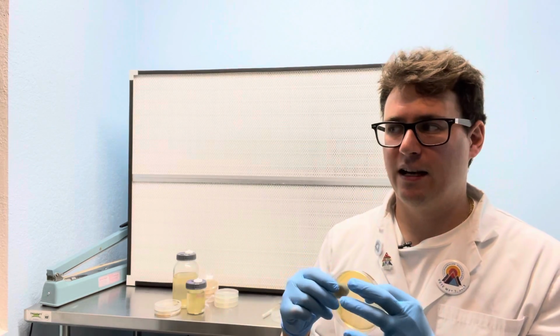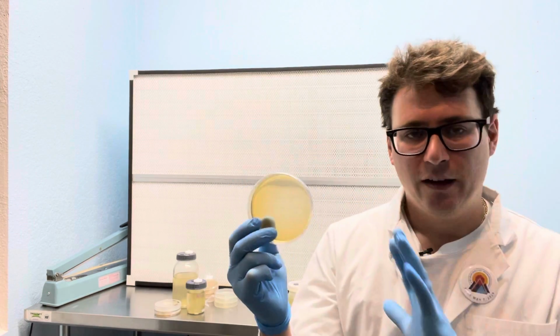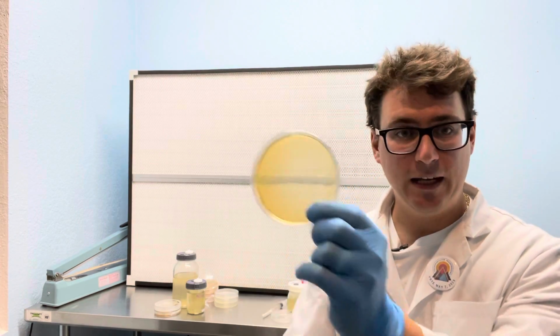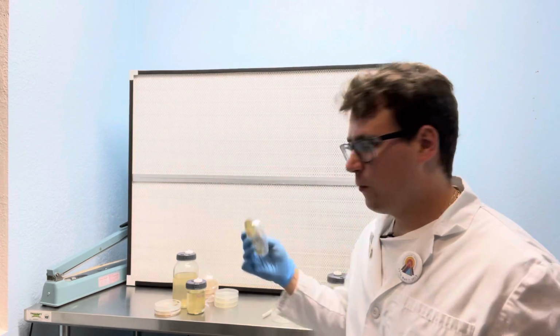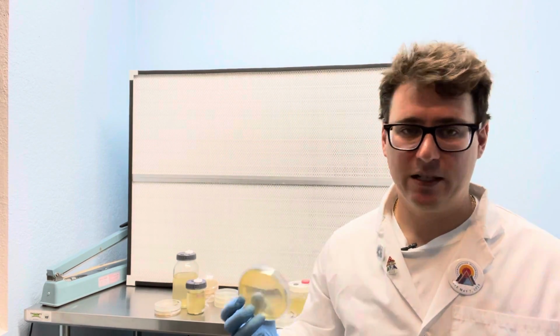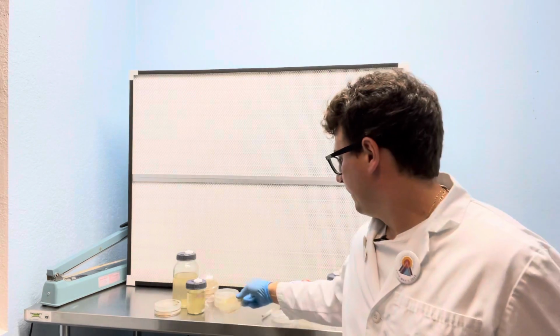You don't want any bacteria or yeast or mold competing with the mushrooms, and agar is the best tool to identify any potential contamination.